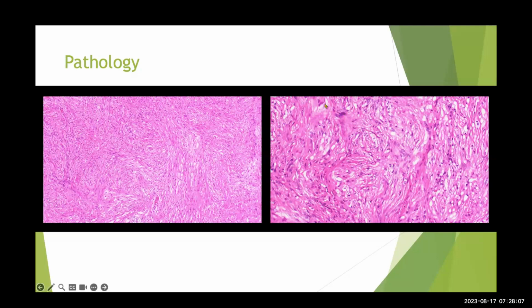Yeah, exactly that. And otherwise, you don't see any meningothelial like elements like some psammoma bodies, whorls, pseudo inclusions. You do not see schwannoma like patterns such as Verocay bodies or Antoni A, Antoni B. And this would turn out to be a neurofibroma.